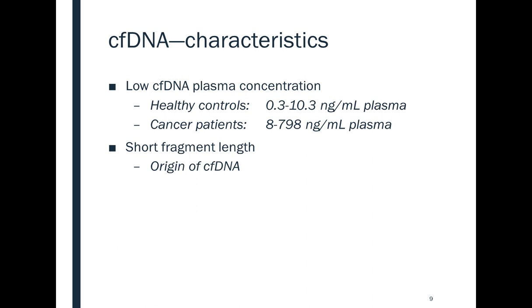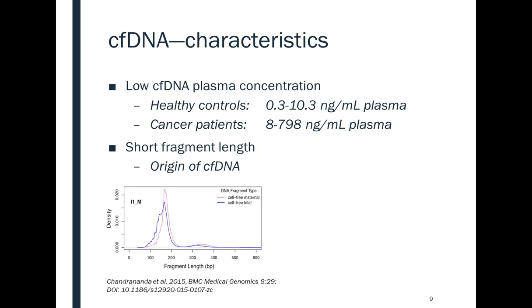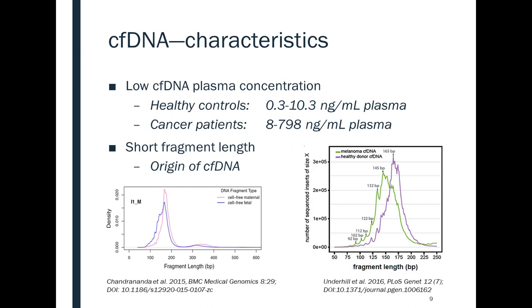Important to know is that cell-free fetal DNA is on average shorter than the cell-free maternal DNA, as you see in the picture. The same characteristic could be found in cancer patients, where melanoma cell-free DNA is enriched in the shorter fragments compared to healthy donor cell-free DNA.